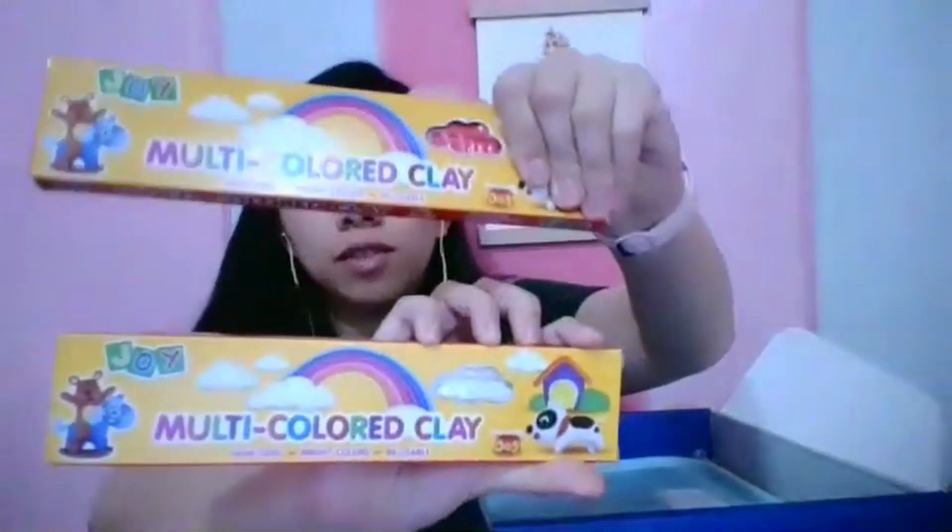The last thing inside my kit are two differently colored modeling clays for one of the activities, especially in general chemistry. You'll be able to use this as well for holding things in place among others. That's basically it for this kit.